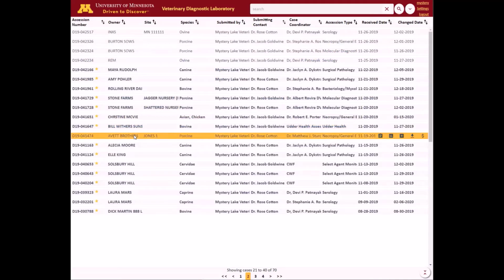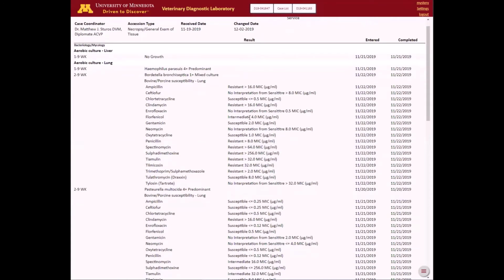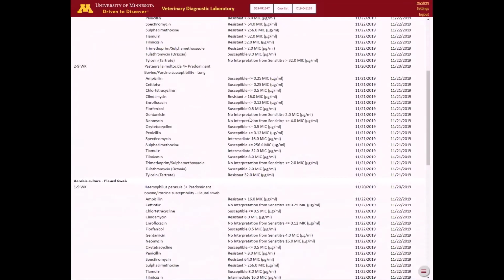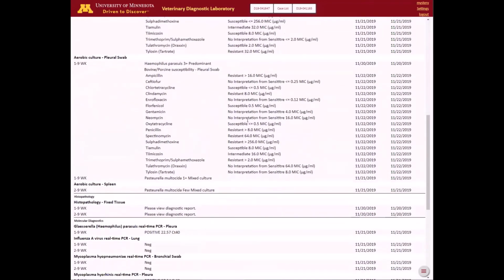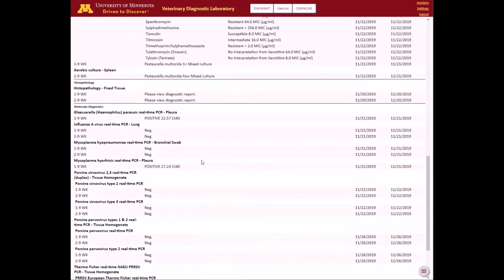Now, let's say we're going to interact rather than seeing just summary statistics or counts. We want to see other information that's associated with the case. So this would involve accessing another page on the case, and that's where these icons to the side would come in. If you wanted to see individual animal details, you can click on the details, and this will bring up results based on the individual animal and give you the full view that you might expect to see for the whole case.